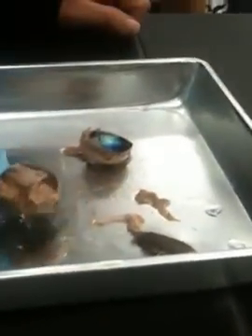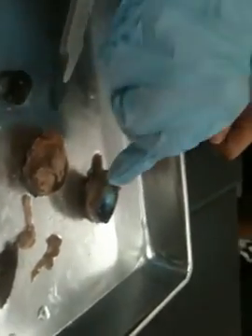Outside layer, right? You can see this. There's a lot of fatty tissue on this, but you can see this white part of the eye. It's the outside layer, right? You can see it in each other's eyes. So that's the sclera. And then there's this dark, like black middle layer. So what do you think that's called?